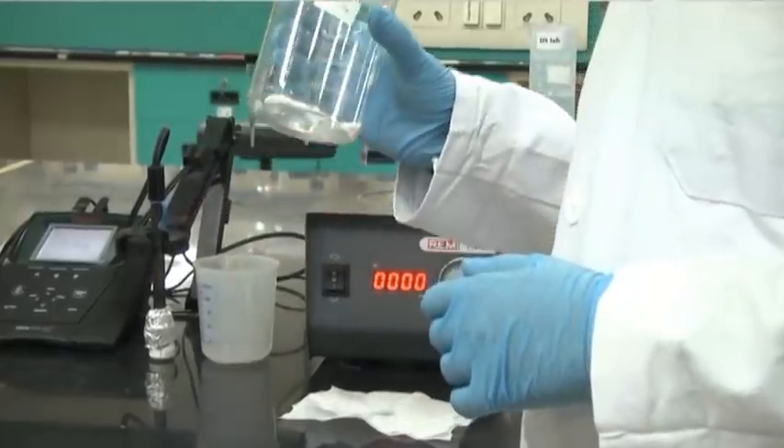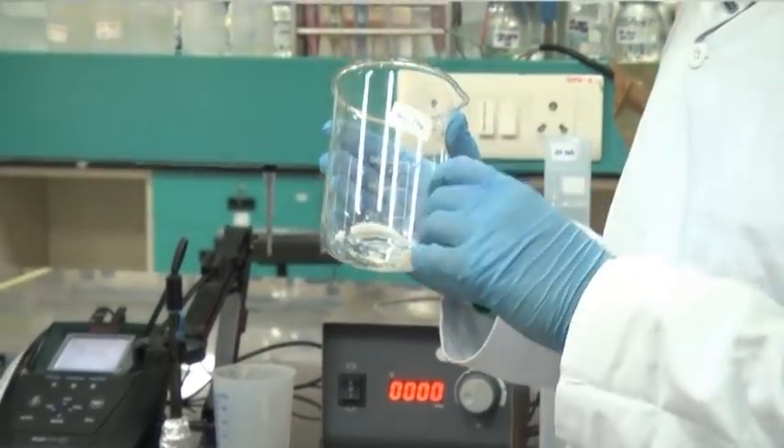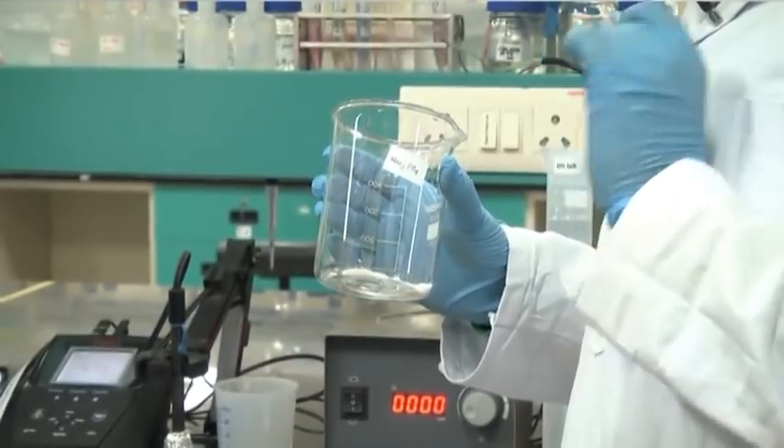Here we have taken sodium phosphate monobasic, around 3 grams in weight. Now we will dissolve it in double distilled water.